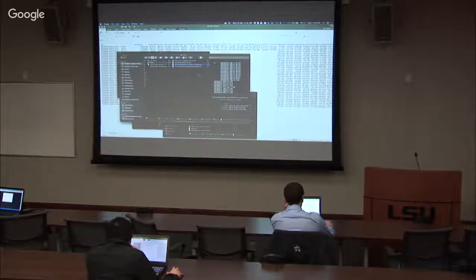So were you going to do quantile normalization, or you already did that? Yes. Probably, yeah. You can either, yeah, that's good. All right. No, well, you got it. I just created it. Okay. Now we start, we want this. But once it's done, you'll be able to download the TXT file, just open it itself. TXT file can go in.